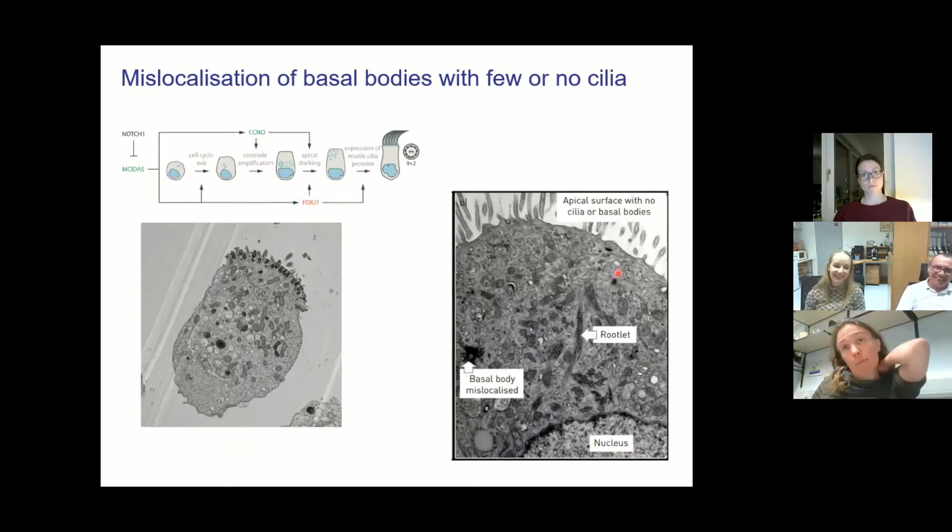So we're not really talking about cilia here, we're talking about the lack of them. And with infection and inflammation, you do see a loss of cilia. But this is an example of a dead cell from a normal sample, and what you see even in dead cells, usually in a ciliated cell, is all of these basal bodies that are going to go and form the cilia, and they sit at the ciliary surface, and then the cilia form from those. So if you have lack of cilia because of an infective process, and we usually suggest that people don't do nasal brushings immediately following an acute upper respiratory tract infection, because you do lose the cilia.